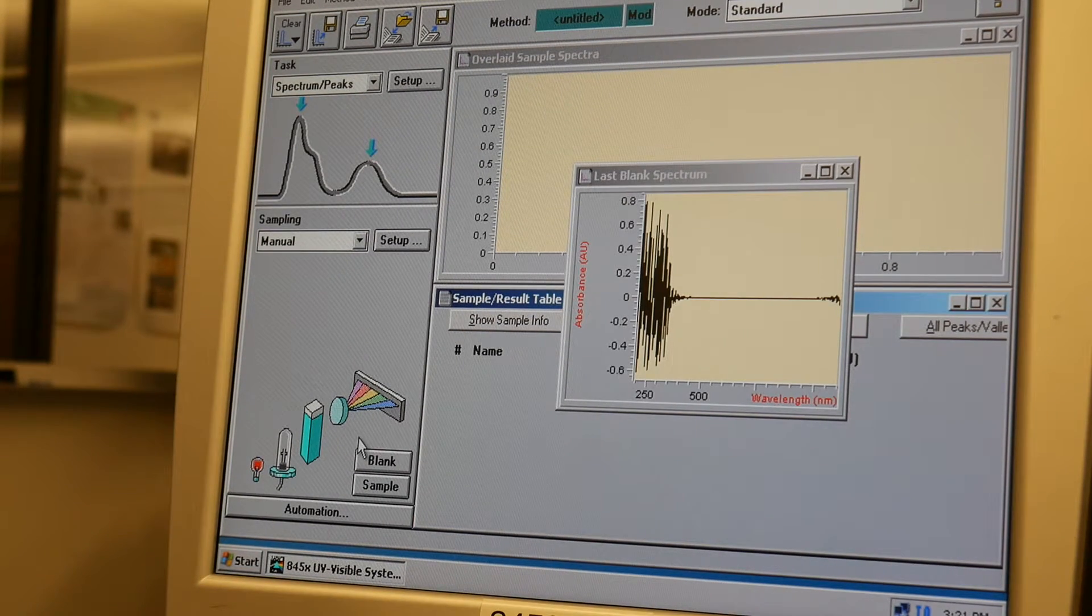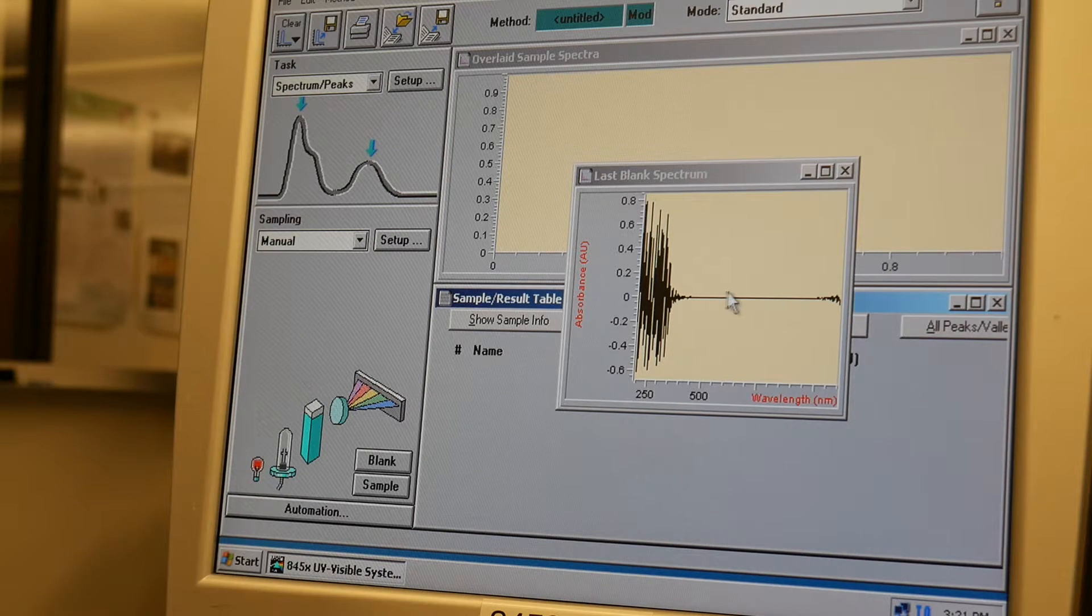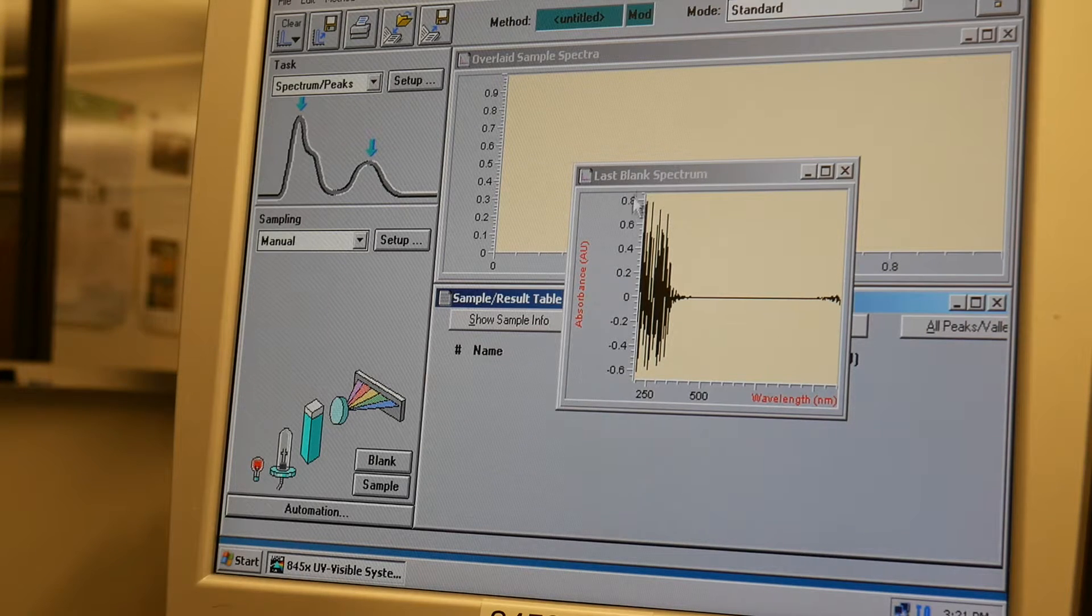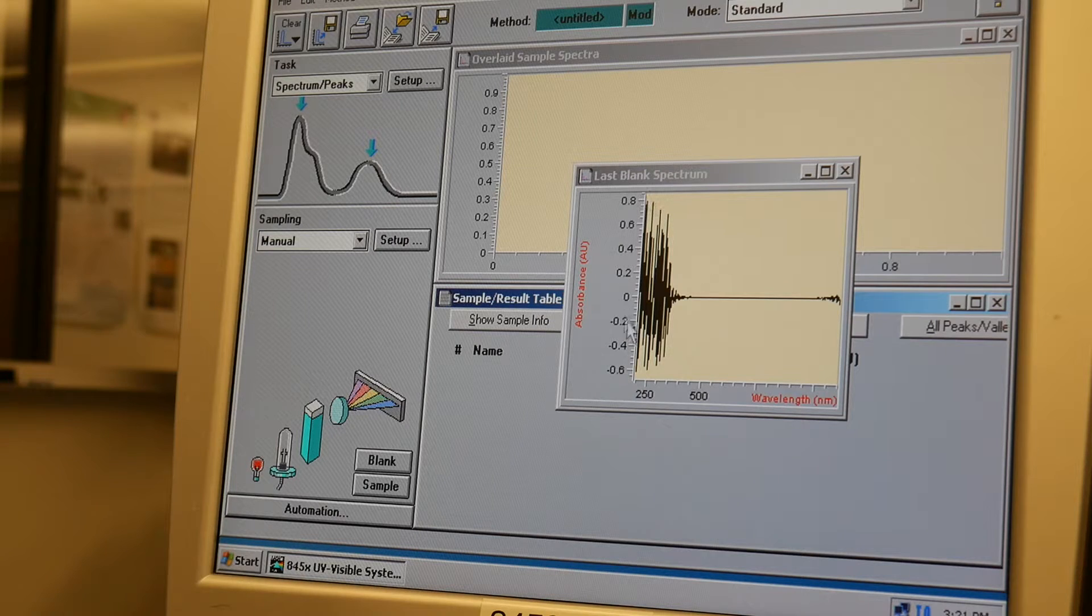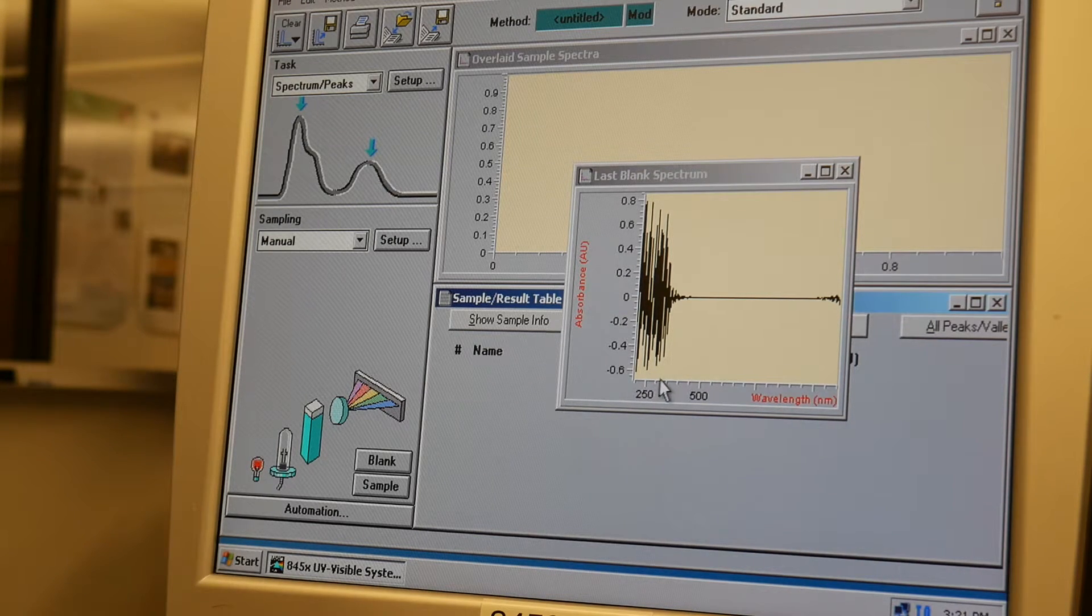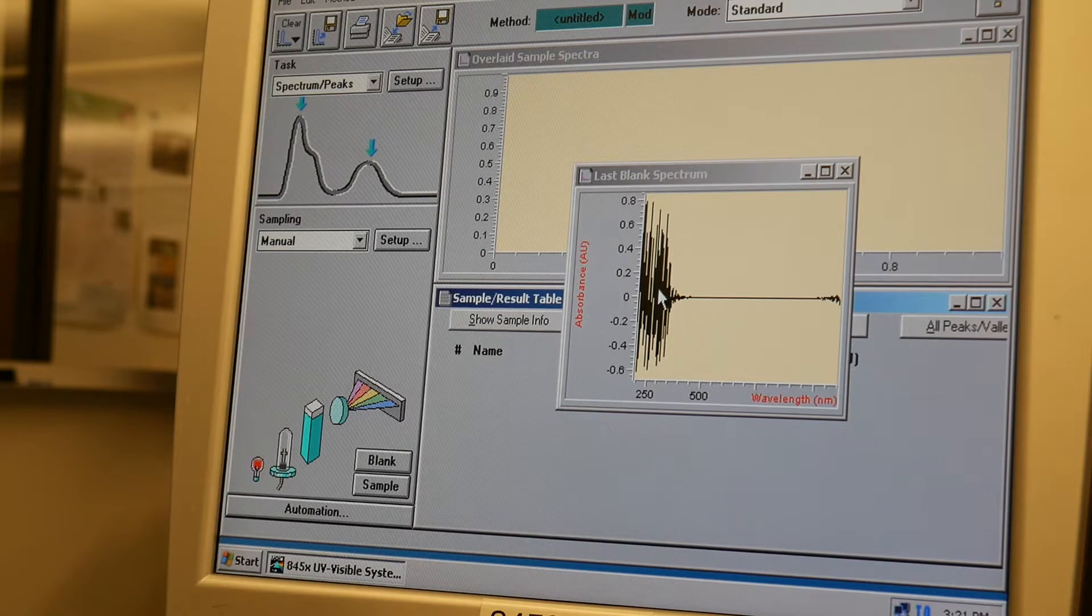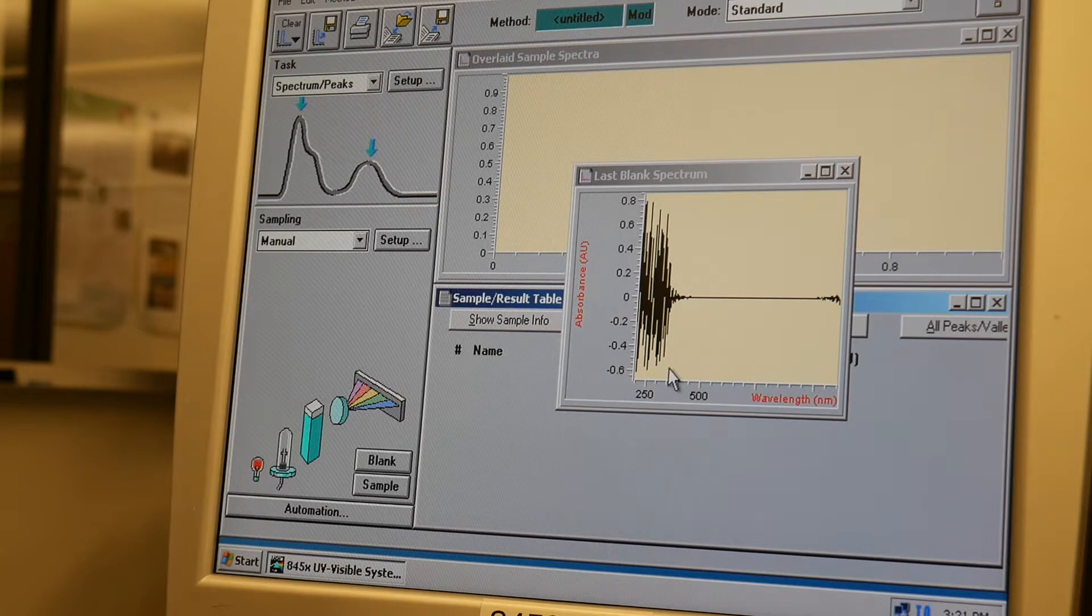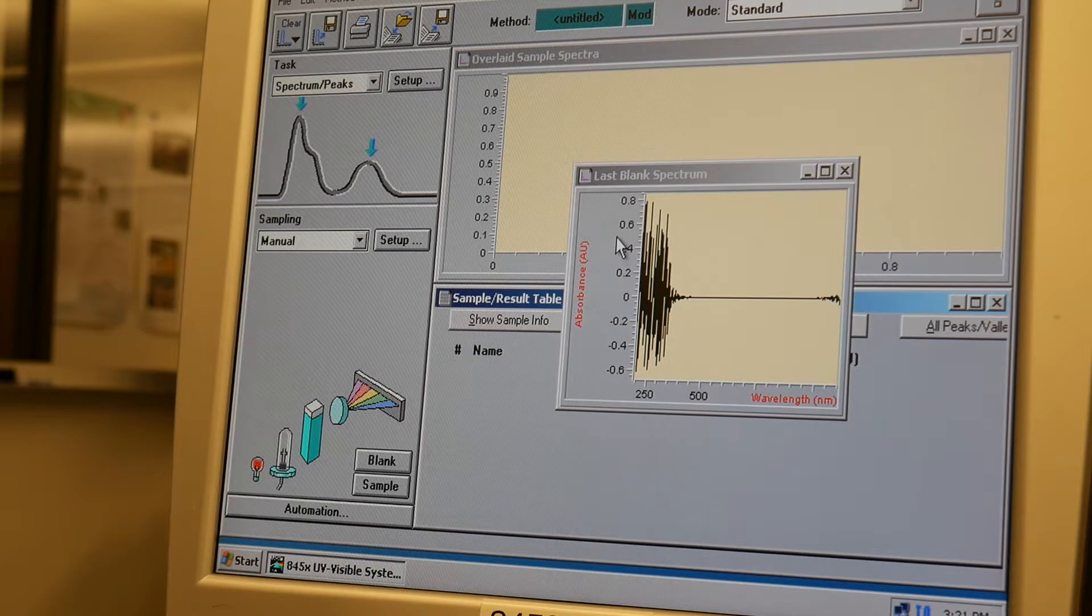What you want to see in a good blank is that it is fairly close to a straight line in the region that you're looking at. Now, some people get a little worried when they see this part right here because that's really noisy. But if you look at the wavelength, this is all in the ultraviolet wavelengths and we aren't measuring ultraviolet.